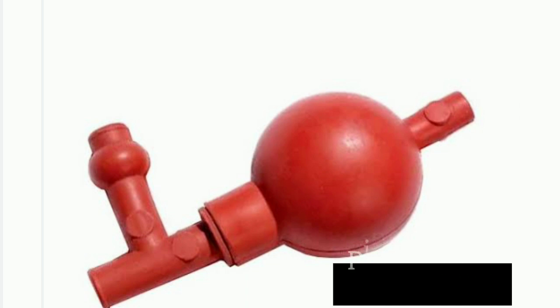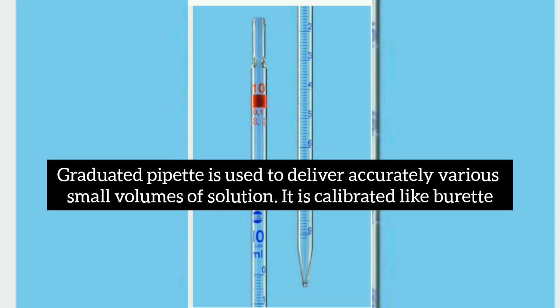Now let's take a look at the first one, graduated pipette. Graduated pipette is used to deliver accurately various small volumes of solution. It is calibrated just like burette.